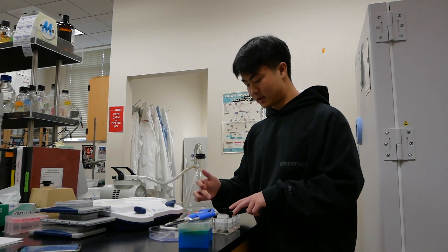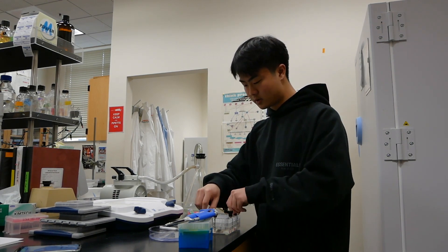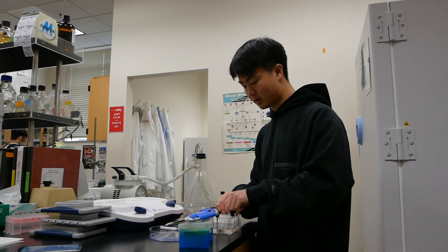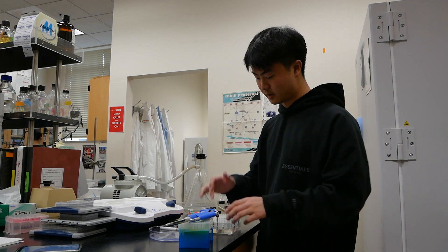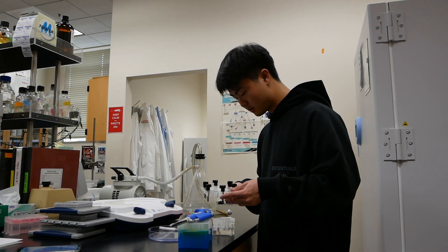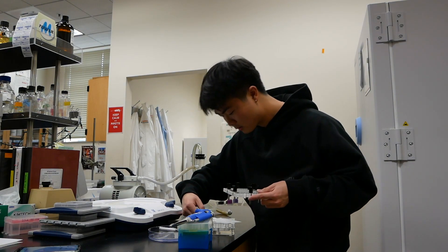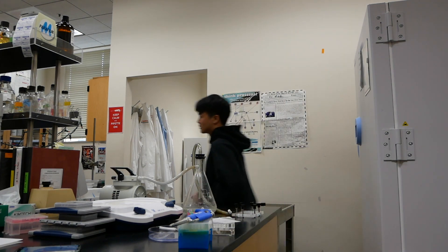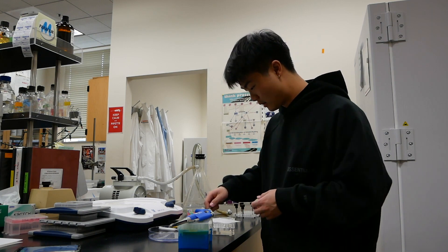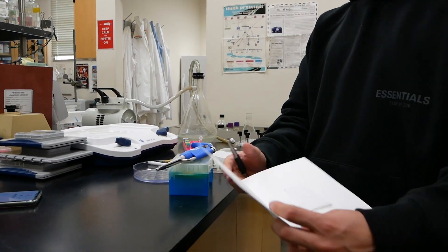Now when all of the protein samples have been suctioned through the paper and into the vacuum, we're going to take the apparatus apart, take out the nitrocellulose membrane, and mark it to make sure we remember which side the proteins are on. Since we put in the protein from the top, the proteins will be on the top side of the nitrocellulose membrane. I'm going to take a pencil, mark the top of the nitrocellulose membrane, and move it onto a piece of Whatman paper. I'll be taking this to the incubator to dry for five minutes.